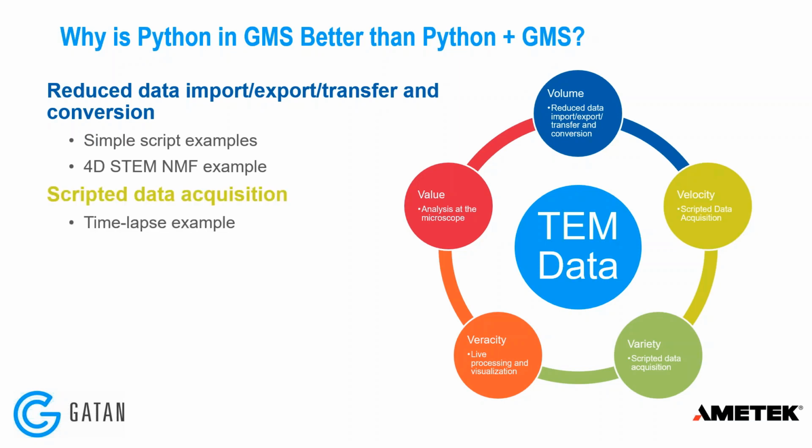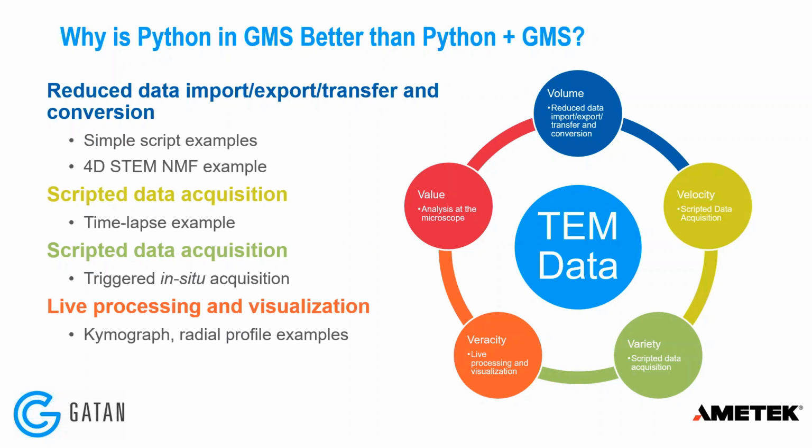Then I'll go into a bit of scripted data acquisition with 2 different approaches. One, time-lapse to control the speed with which data is collected, and then another, triggered in situ acquisition, where the number of different signals that are acquired can be enhanced using scripting.